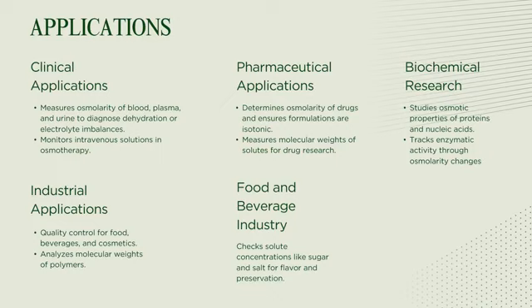It determines the osmotic properties of proteins, nucleic acids, and other biomolecules. It helps in understanding their behavior in solutions such as aggregation, dissociation, or hydration. It measures changes in osmotic concentration during enzymatic reactions, helping to study enzyme kinetics and substrate binding.